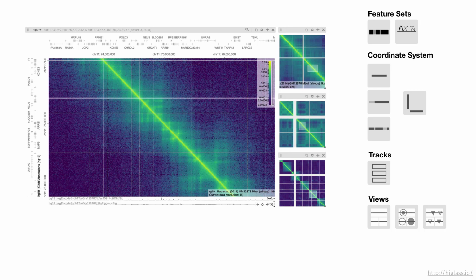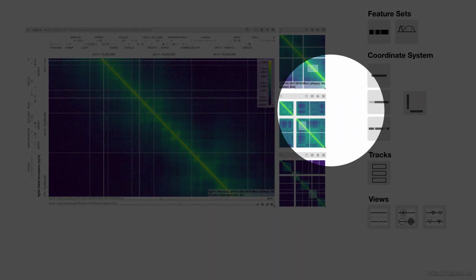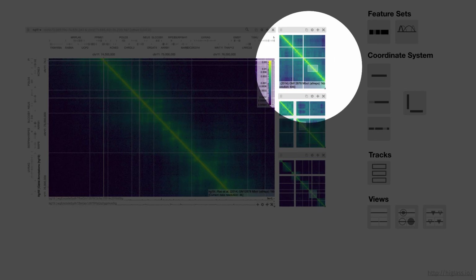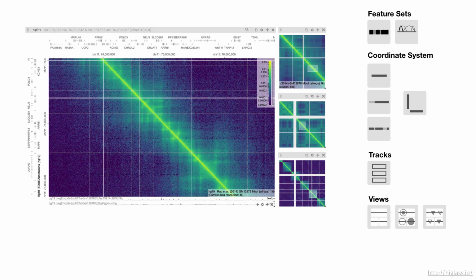What you can't really tell from the back is that we are looking at different scales. This view here is a very large overview. Each block here represents a chromosome. This is the area that we selected. This area is enlarged here. So this little white square is this one here. And then you can keep going. And then this view has its own detail view, which is up here. And so this little white box in here is this view. So this is how this is configured.